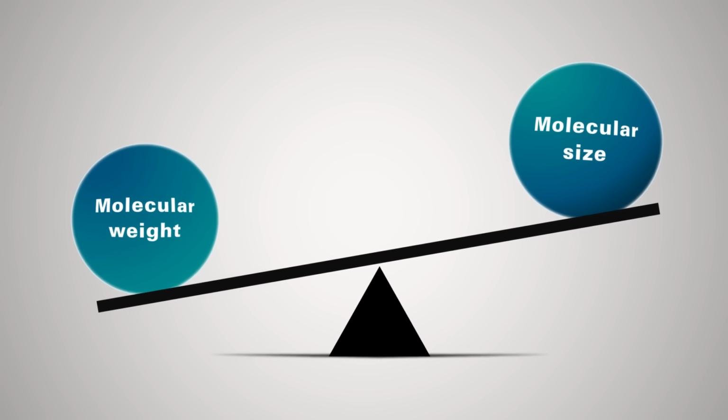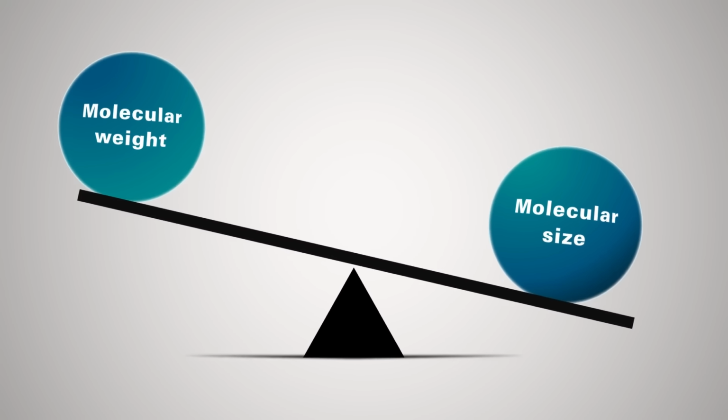Oh, I see. Based on what you just explained, its application, particularly for measuring the molecular weight or size of molecules, has a very wide range. To me, that could be one of the key advantages.